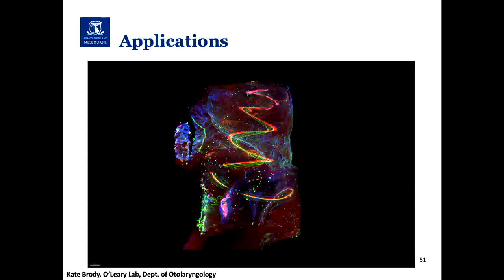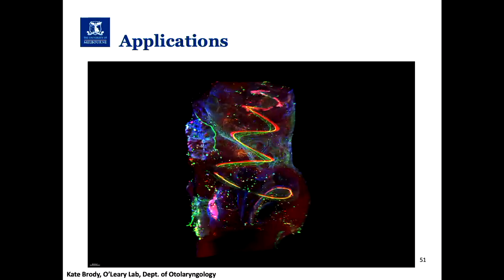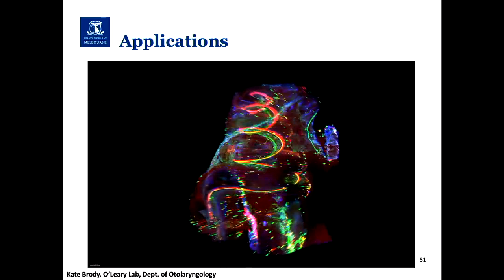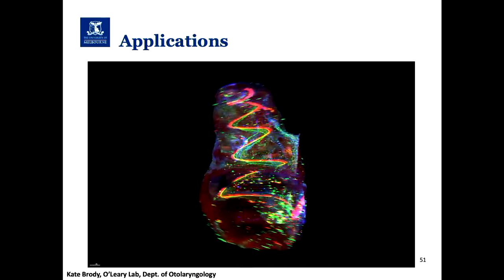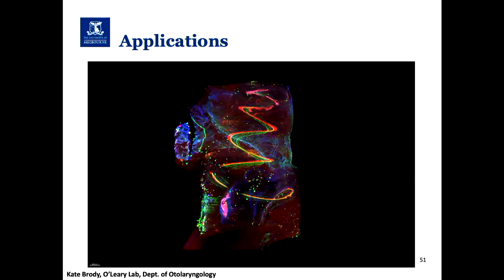We have our light sheet systems in the lab in this building. This is one of the images which was taken on that system. This is a cochlea. And here the researchers were looking at a 3-color imaging experiment. They're now pushing up into 4 colors. They're actually looking at cochlear implants and how they affect the tissues around them, how much scarring goes on when you do a cochlear implant.